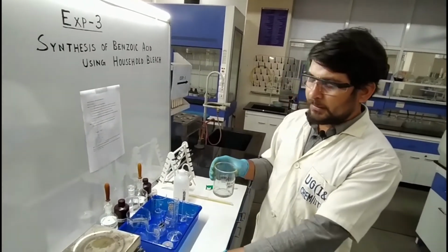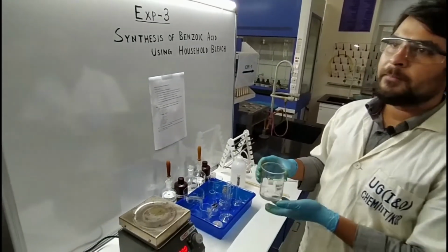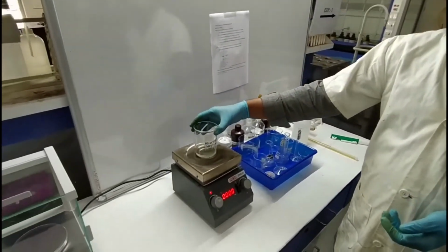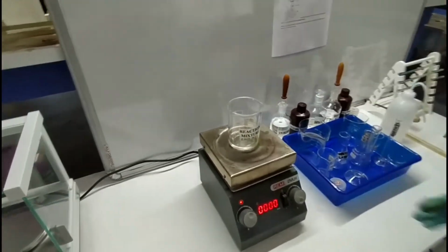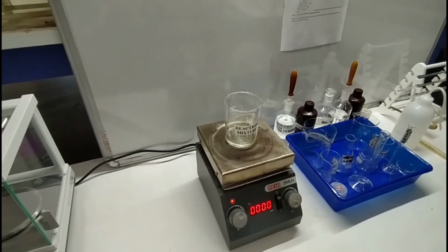The temperature is already set in this hot plate. So I'm just going to put this one over here, and we have to wait 30 minutes to complete the reaction.